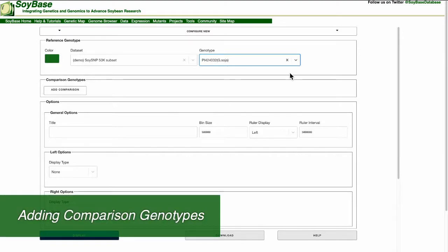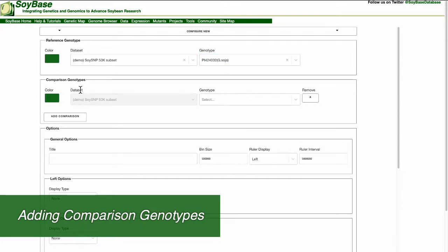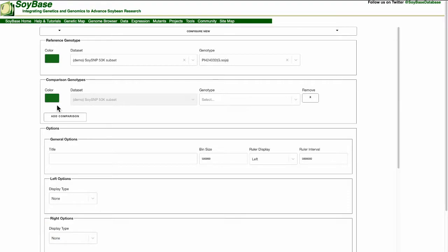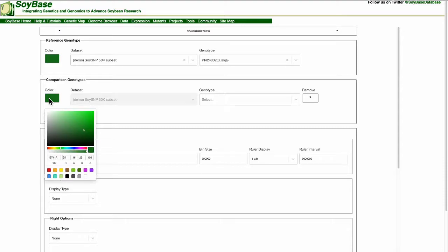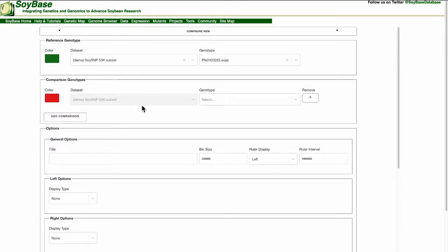Once we have selected a reference genotype we are going to add a comparison and choose a line to compare to our reference genotype. So first like the reference genotype we want to pick a color to represent the comparison. In this example I'm going to pick the red color. Since GCivit can only compare lines within the same data set the data set box has already been filled and cannot be changed.